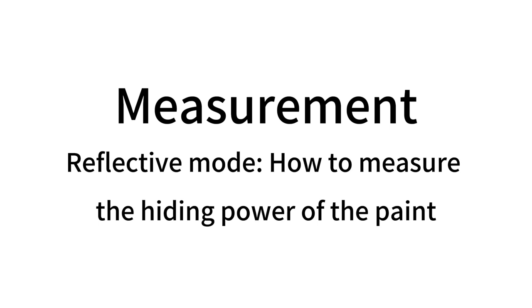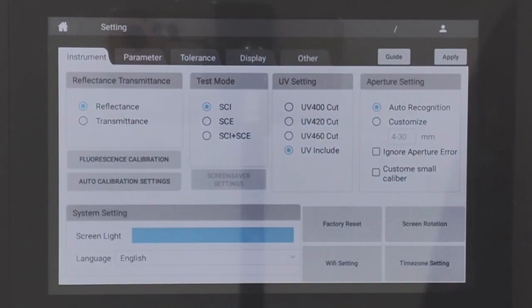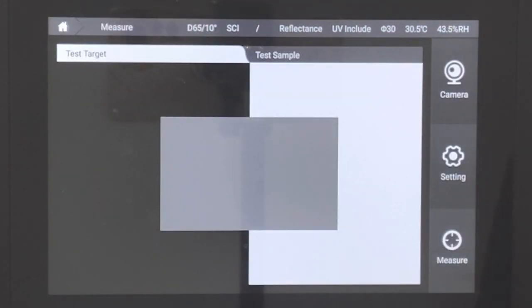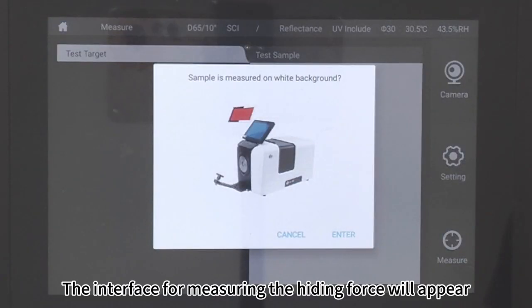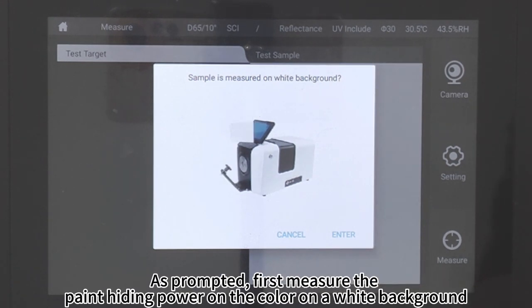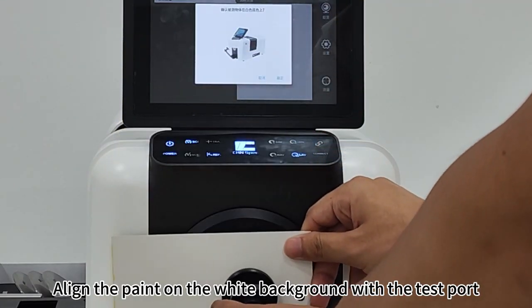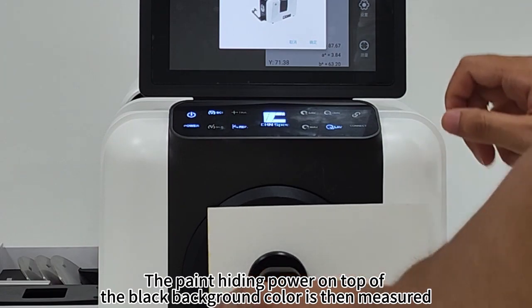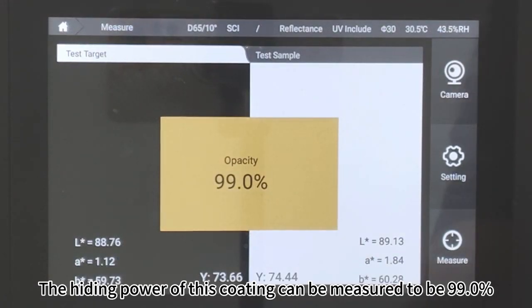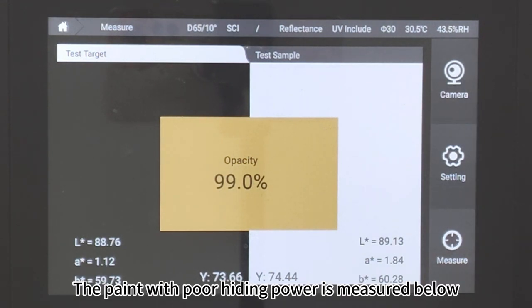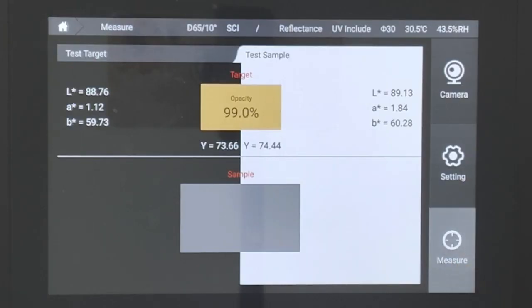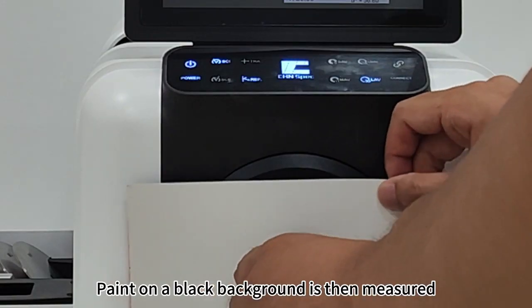Reflection Mode. How to measure the hiding power of paint: Click Setting, then click Display Opacity. Click Apply, then click Measure. The interface for measuring hiding force appears. As prompted, first measure the paint hiding power on the white background — align the paint on the white background with the test port and click OK. Then measure the paint hiding power on the black background and click Enter. The hiding power of the coating is measured at 99.0%. A paint with poor hiding power is then demonstrated — first measuring on the white background, then on the black background.